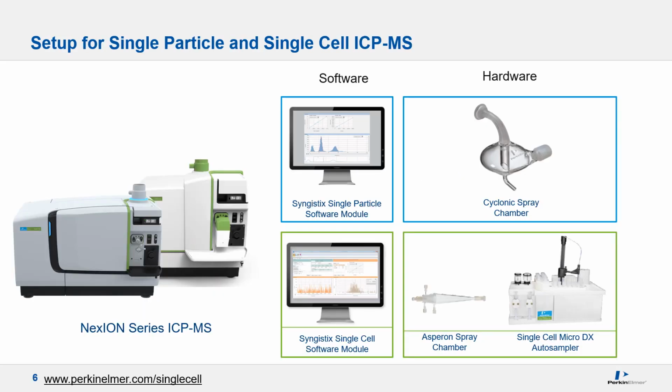The setup for single particle and single cell ICP-MS is different because cells behave differently than nanoparticles, and the software also focuses on different aspects of the evaluation. The distributions for nanoparticles are reported in size. The distributions for cells are reported in mass. So the software takes this into account for the two different models. We have a single particle software module and a single cell software module.